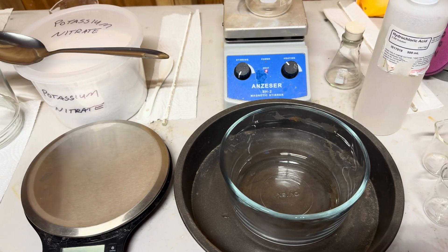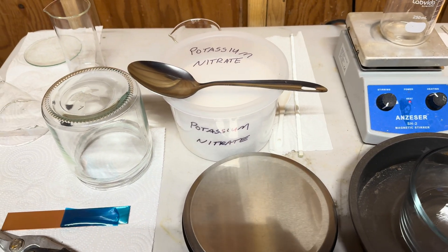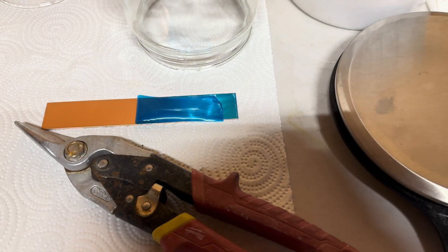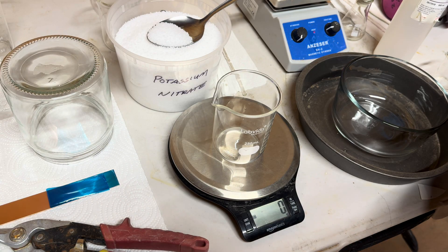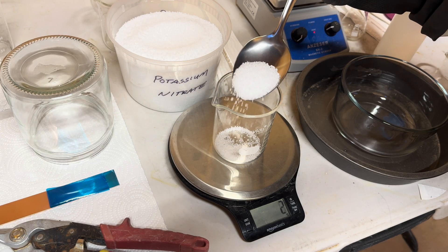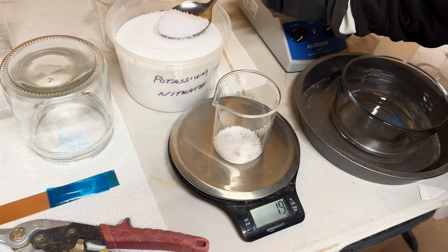For our project today we have some distilled water, some hydrochloric acid, some potassium nitrate, and some copper. Today we are making nitric acid. Nitric acid is an extremely useful acid capable of dissolving copper and silver.